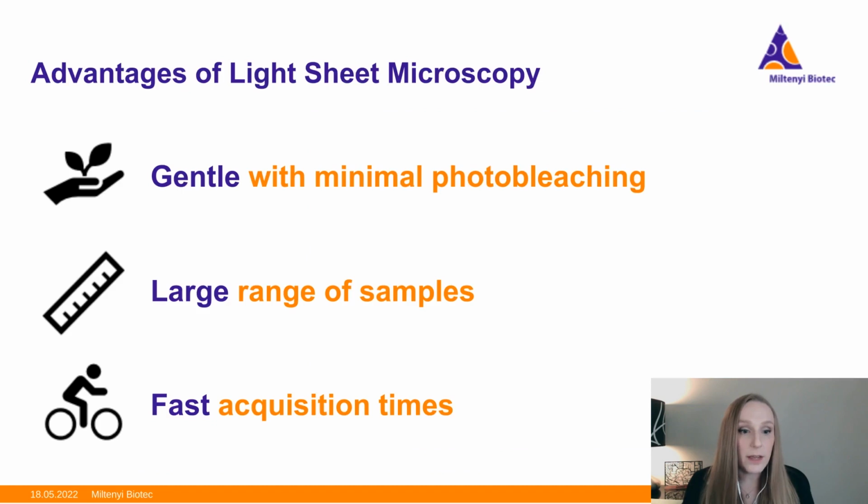And then not only that, we've really got fast acquisition time. Because we're not having that requirement of blocking out-of-focus light with a pinhole or scanning across a field of view to acquire the signal with PMTs, the light sheet microscope can achieve these faster acquisition times and still be able to resolve individual cells.